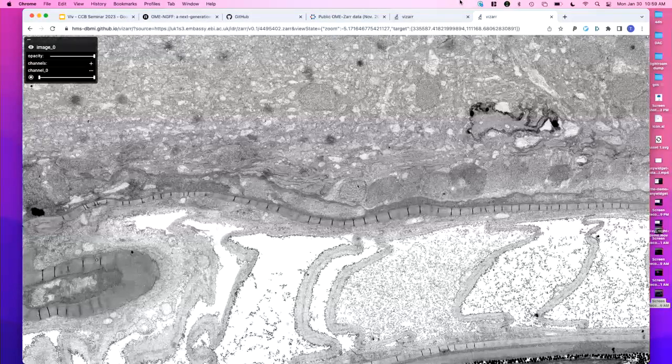That's super helpful. I do think that there's a place beyond just random party tricks for image analysis. I think it can be a really powerful hypothesis generation tool in a lot of different spaces. The more of this data we're able to aggregate and coalesce into the same place, the more utility you're going to see in those visualization pipelines for other sorts of data. You guys are clearly aware of the power of it for your types of data, but I think it will start to spill over into other places as well.